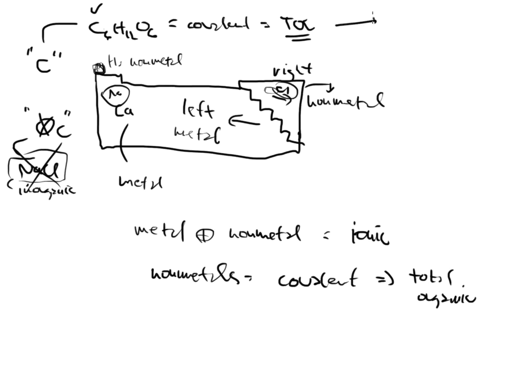Now, the next one is that there are two classifications under this: NPOC, which is non-purgeable, and the purgeable organic compounds, POC. Or write out the word purgeable, it doesn't really matter, but hopefully you'll know what I mean if I do write POC. Well, sugar isn't very volatile.